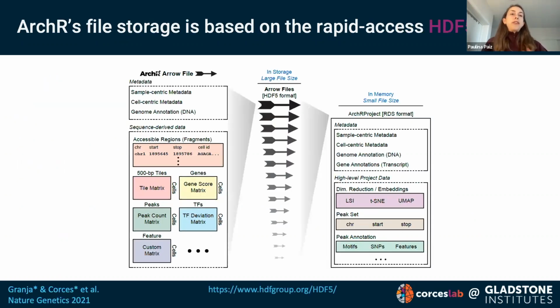So ArchR's file storage is based on the rapid access HDF5 format. HDF5 stands for hierarchical data format and was designed at the National Center for Supercomputing Applications.